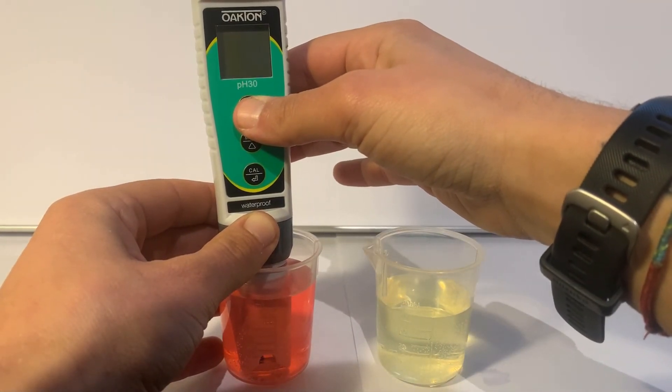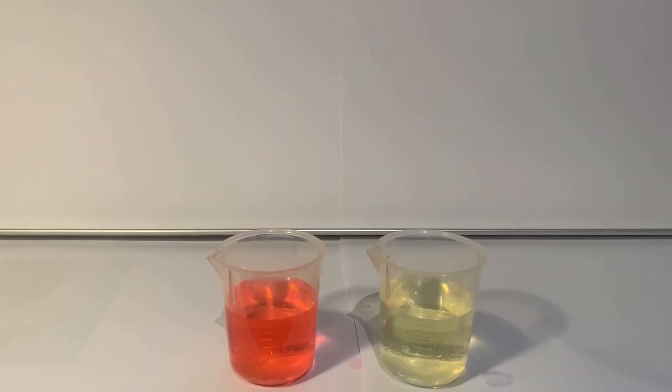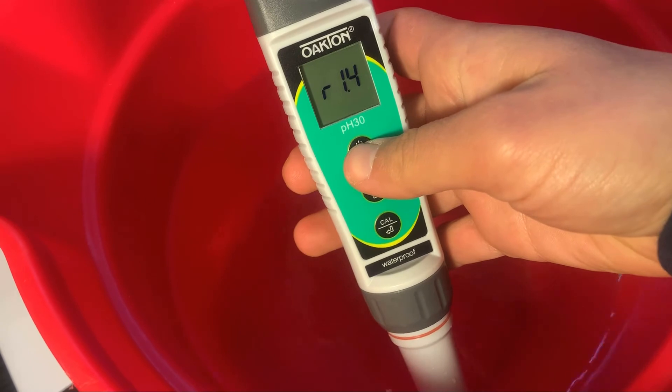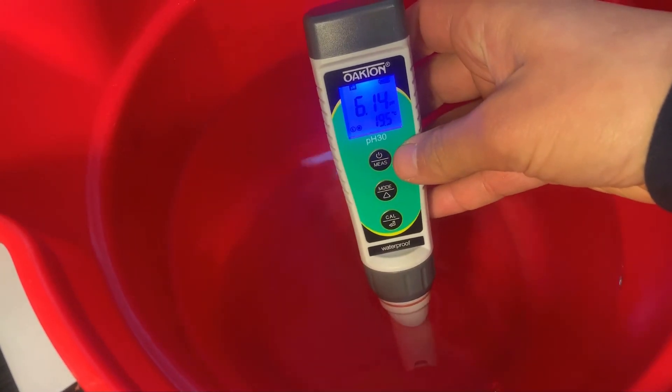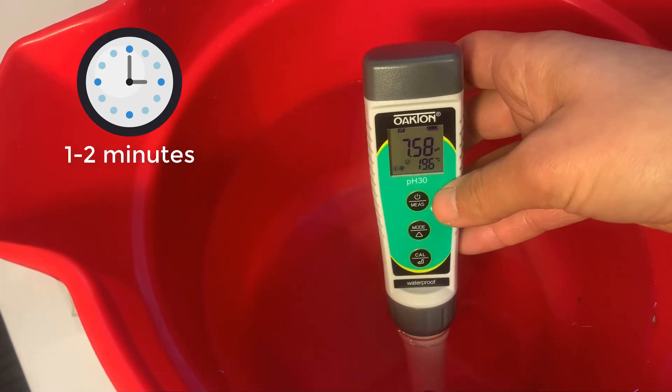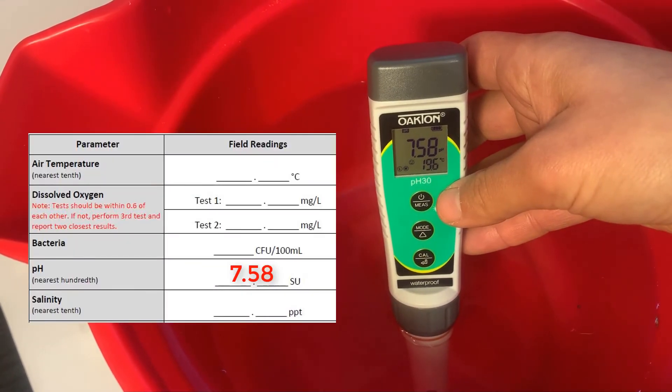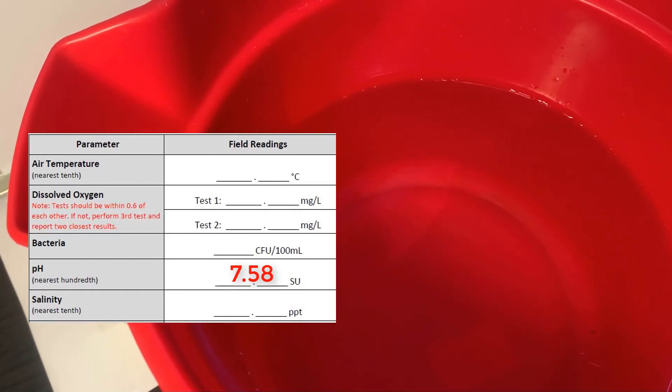Turn off your probe by long pressing the power button, then rinse with water and replace the cap to take it into the field. When you are in the field, short press the power button to turn it on. Place your probe into the sample water and wait a few minutes for the stabilization icon to appear. Record the number on the top of your screen as your pH reading on your data sheet.